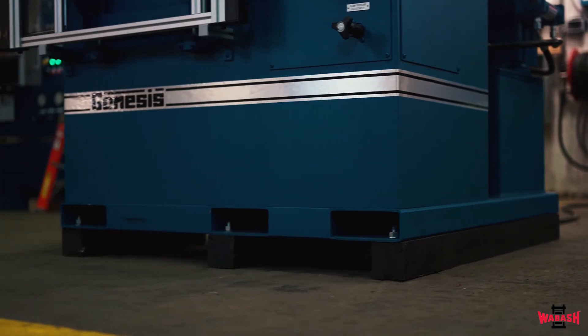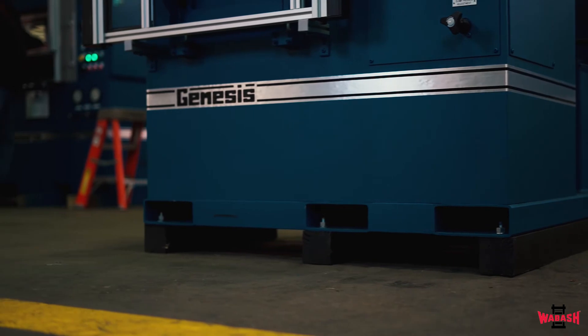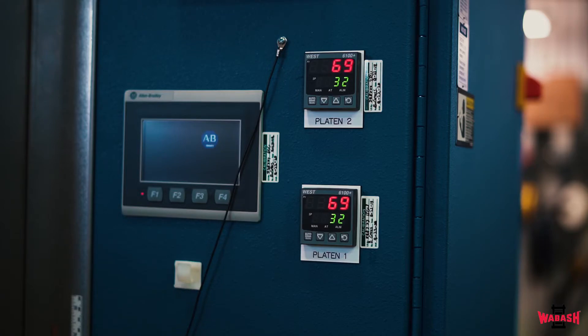Other features included in the base price are lifting tubes for ease of getting the press into your lab or production facility. Calibration certification traceable to the NIST of the clamp force, platen temperature, and PLC timers is standard on this press.